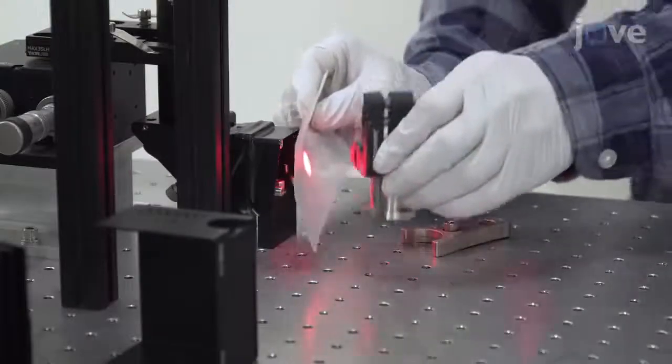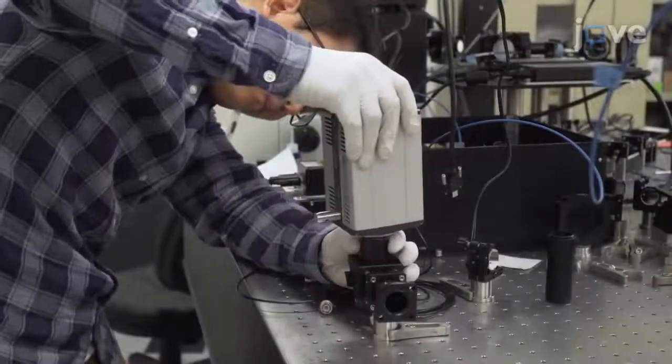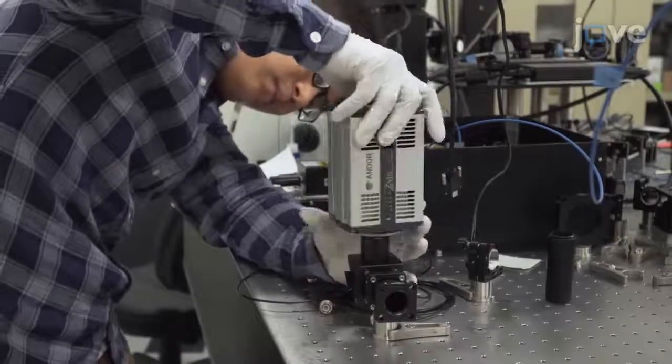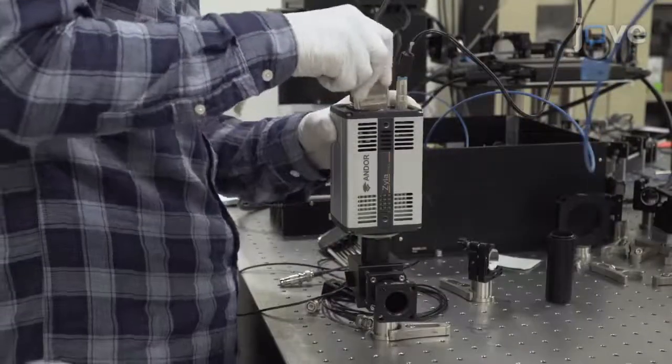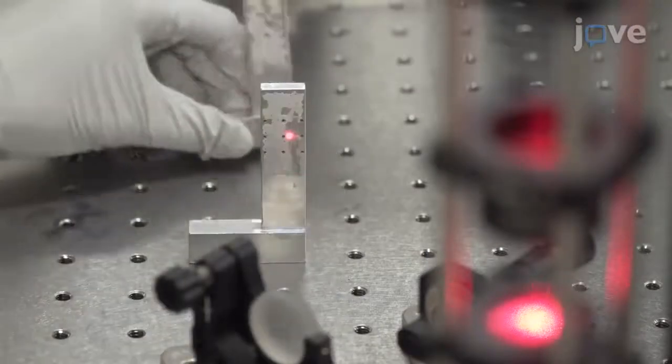Insert a dichroic mirror in the beam path and reflect the beam by 90 degrees. Add mirrors to allow adjustment of the transmitted beam's path to an SCMOS camera. Use the mirrors to ensure the beam hits the center of the chip.